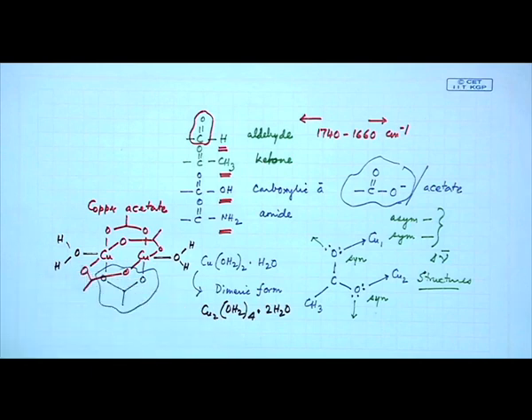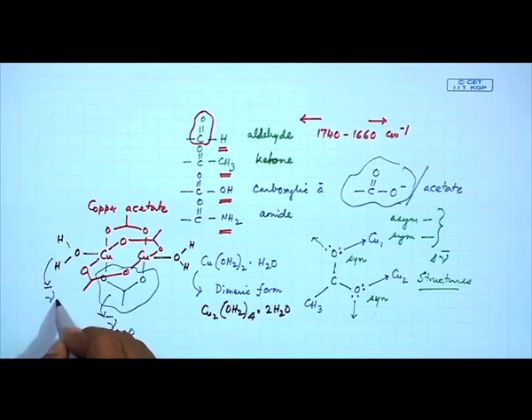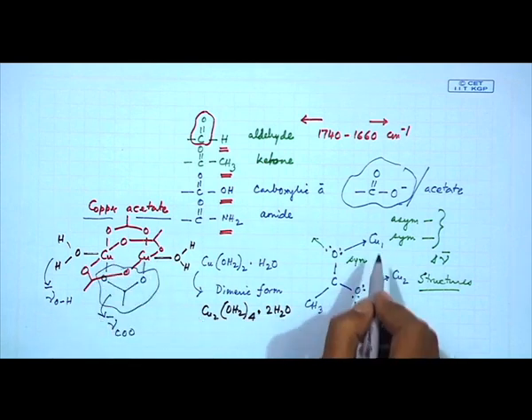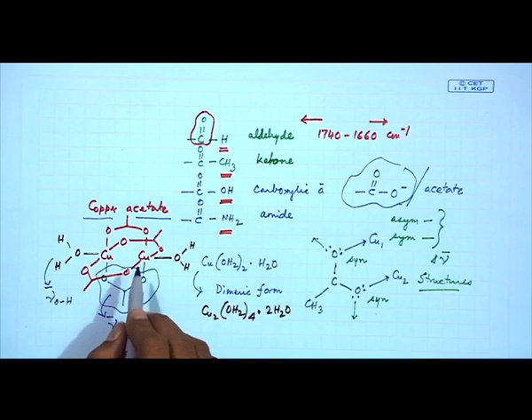The presence of these water molecules also gives rise to the corresponding characteristic stretching frequency, as this will be for COO. Similarly, we get this for your nu bar OH function. So, if we think that this is a particular structure of copper acetate, we get the characteristic stretching frequencies for this, which also identify that you have a syn type of binding for this typical copper salt.